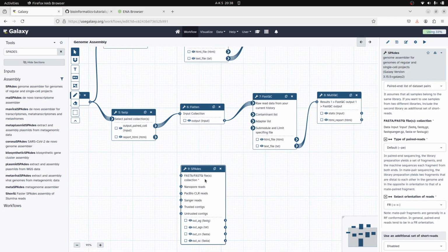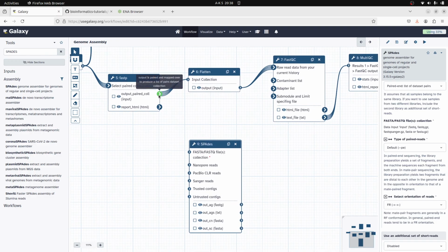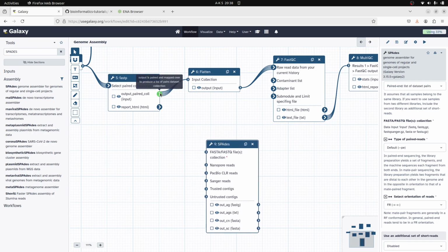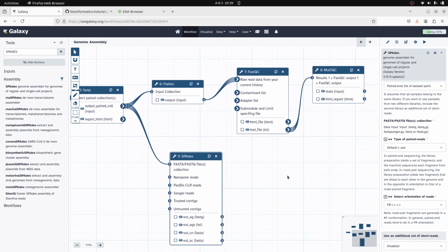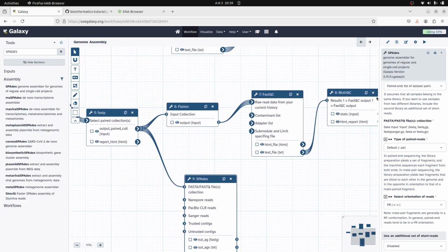When you click it, you can come back to the FastP, which is here. And then the FastP outputs, let's put this here. The FastP output here, I want you to pull it to the FastQ fast collection. Pull it here. And then that is it. All right, so we have our workflow, which has been done nicely for us. So now what we can do is to save.